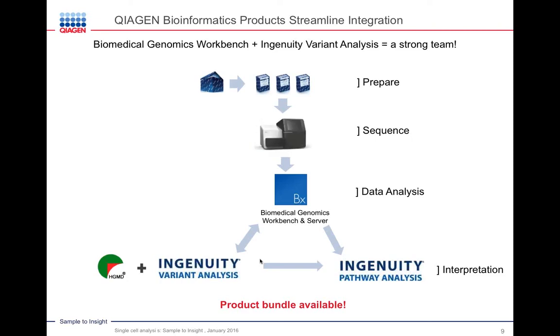information from an individual and use that to understand their phenotype. And there you might be able to understand information about drug mechanisms and associate the drug mechanism with a cellular mechanism. And that cellular mechanism can then further be associated with a molecular mechanism. And that molecular mechanism can then be tied to a very specific RNA or DNA alteration. So the DNA alterations or the SNVs would be what is highlighted in Ingenuity Variant Analysis, and the differences in expression are highlighted in Ingenuity Pathway Analysis.